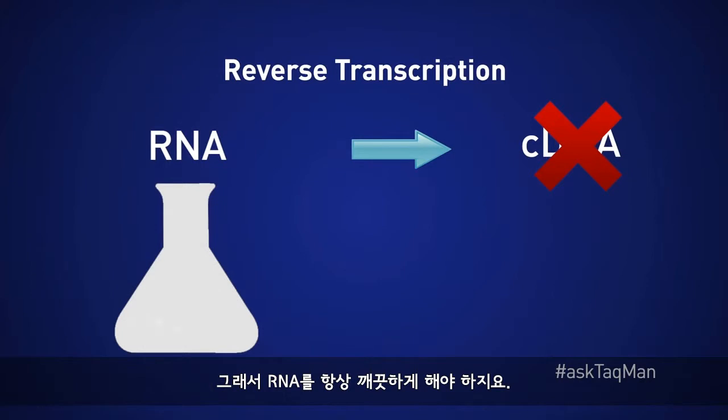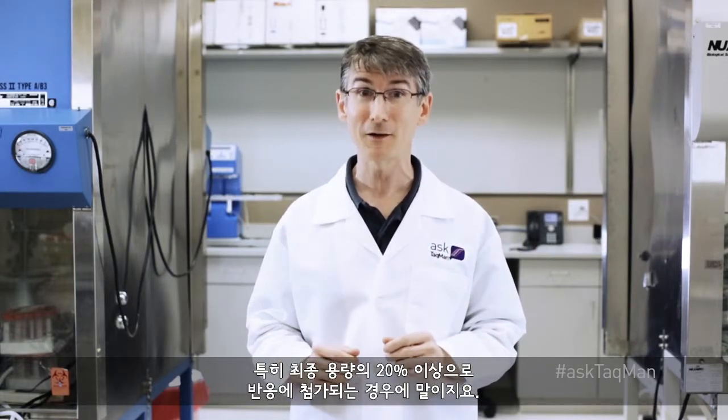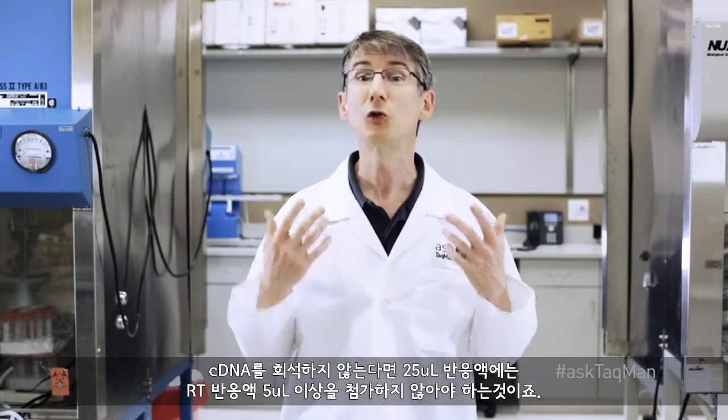That's why RNA should always be squeaky clean. Reverse transcription buffers can inhibit PCR, especially if added to reactions at greater than 20% of the final volume. So if you aren't diluting cDNA, don't add more than 5 microliters of the RT reaction to a 25 microliter PCR.